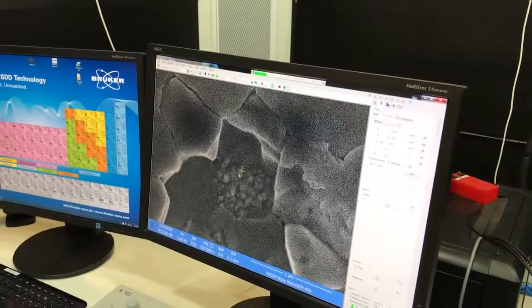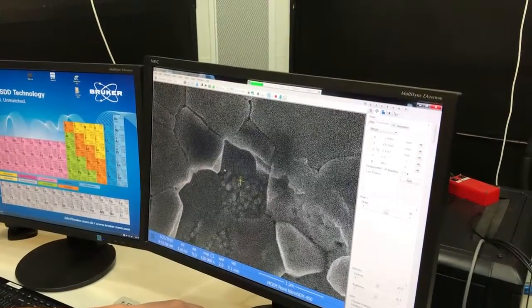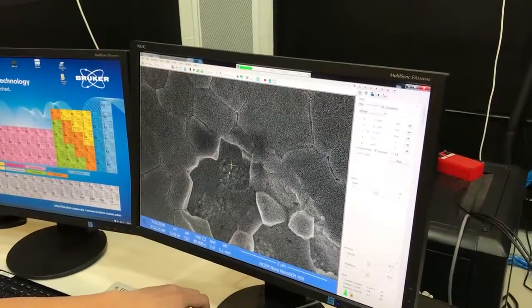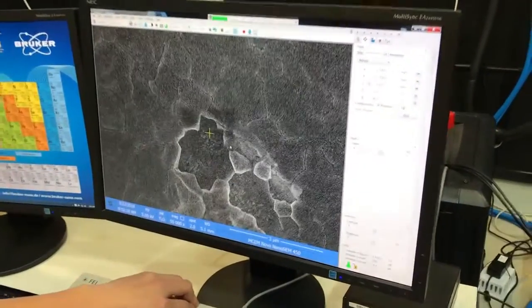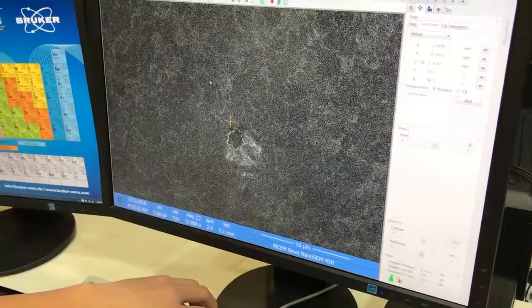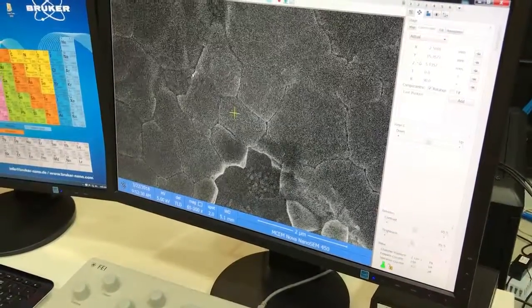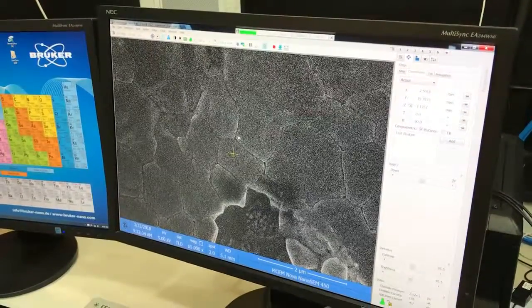Excellent. So that little bit there that's really bright, that's overhanging nothing. There's nothing under that except there's a gap between that and the rest of the specimen, I suppose. Yeah, because there's a bit where the film has flaked away. Yeah, that's right. And we're getting such excellent contrast. Wow. You can see the beautiful grain structure associated with Wen Liang's film here. Okay, so now the microscope is well aligned, and we can start to take the images.